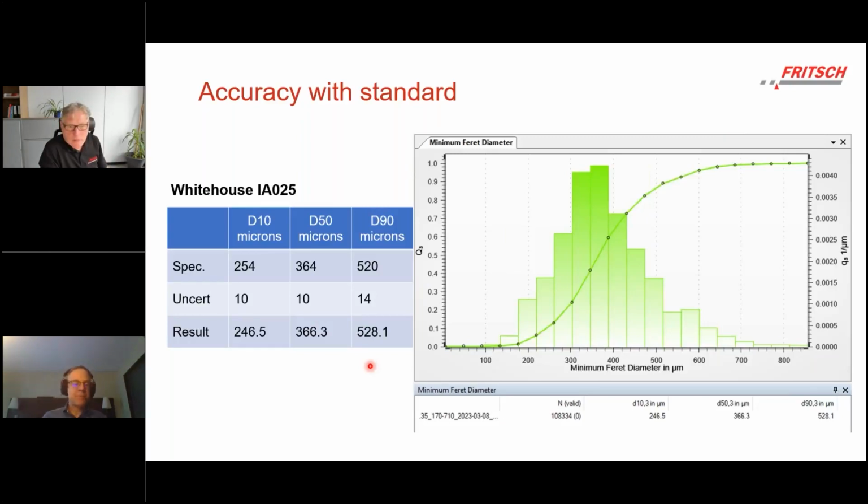And while I have my soapbox, I'm just going to mention sampling. If someone sends you a drum of particles that have been vibrating on a truck for the last 500 miles or 1,000 kilometers, wherever you are, then you're going to find the large particles on top and the small particles on the bottom. If you scoop off the top, you're going to get the wrong answer. So you need to draw off random spots in the drum.